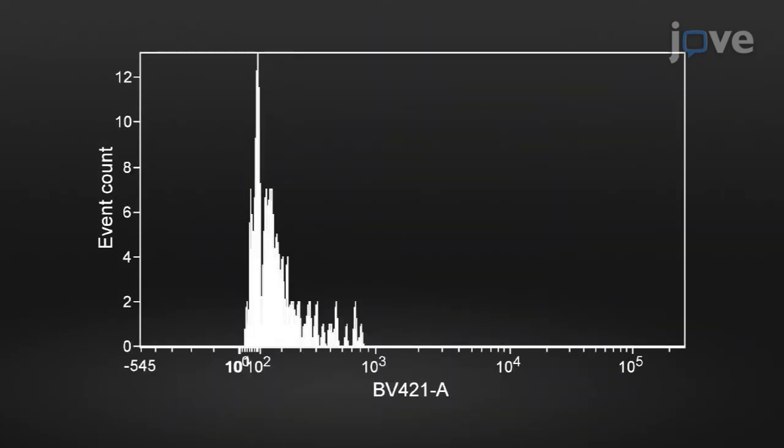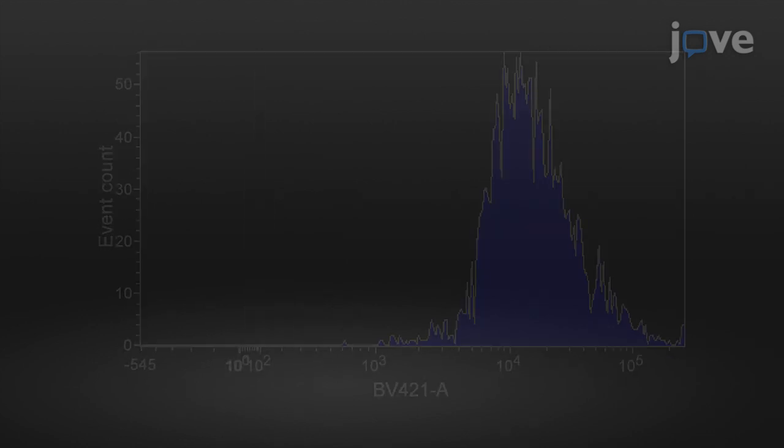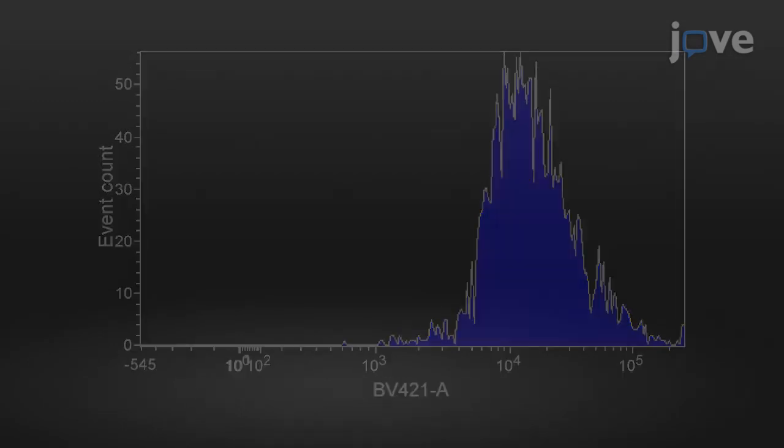Enrichment of isolated nuclei was performed with flow cytometry by gating on the presence of a HOECHST fluorescent signal. Unstained nuclei displayed background fluorescence, while stained nuclei exhibited a strong fluorescent signal. The unstained and stained nuclei were well segregated in the violet channel.